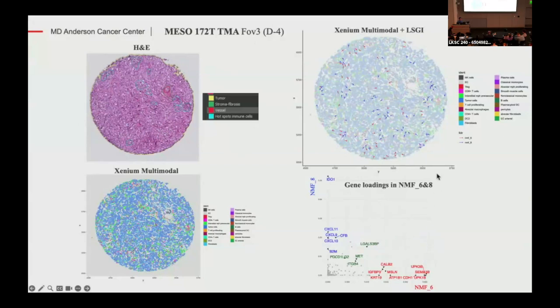But interestingly, the major programs identified, for example, this y-axis blue program, the top gene is actually IDO1. I found this very interesting because that's also what Aaron talked about yesterday on granuloma. IDO1 gradients actually drive a lot of the spatial organization of those. Maybe it's shared between cancer and granuloma. Who knows? The other program is more tumor-specific, with expression of genes like mesothelin genes here.